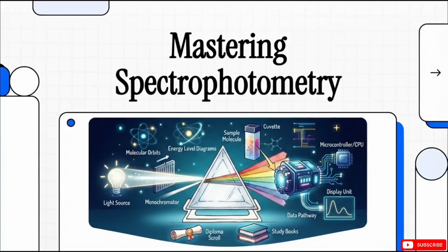Today, we've got a highly focused session designed specifically for those of you gearing up for your diploma examinations. We are going to completely master the core concepts of spectroscopic methods of analysis, and we're putting a massive spotlight on the working principles of the spectrophotometer. Just a quick heads up, we'll be tackling gas-liquid chromatography in our next dedicated explainer, so keep an eye out for that. But for today, if you've been looking for a clear, structured way to visualize these instruments and understand exactly how they identify chemical substances, you are in exactly the right place.